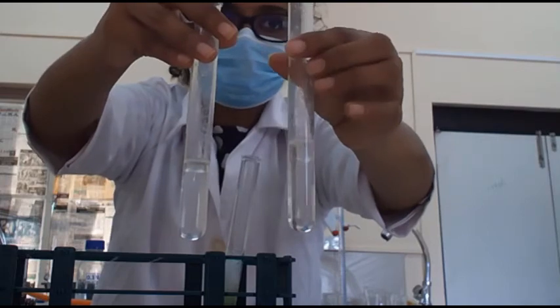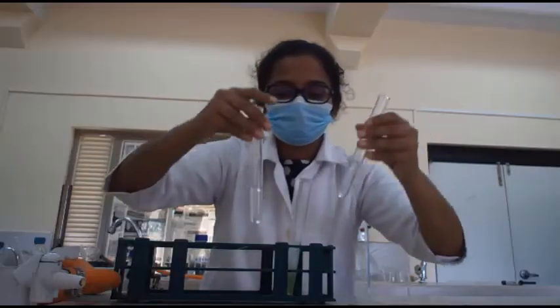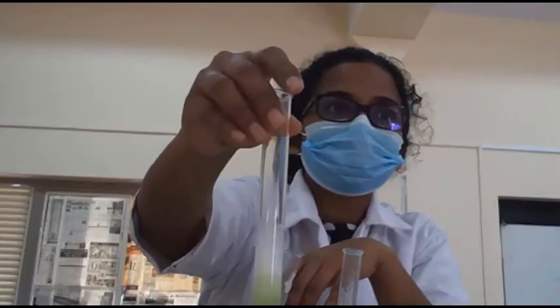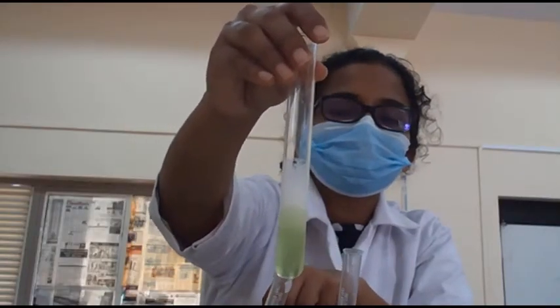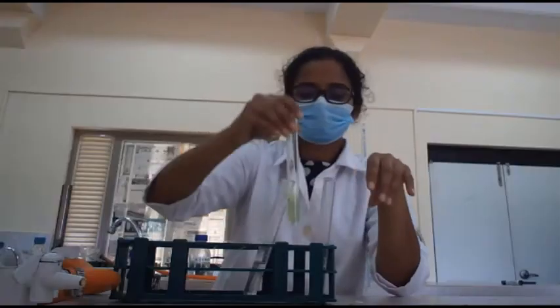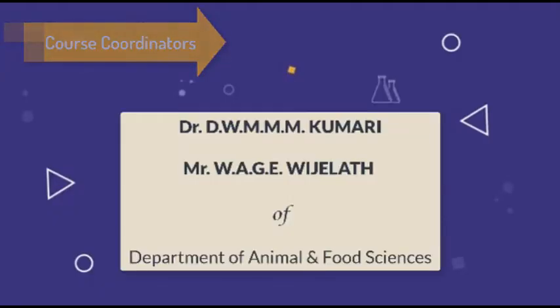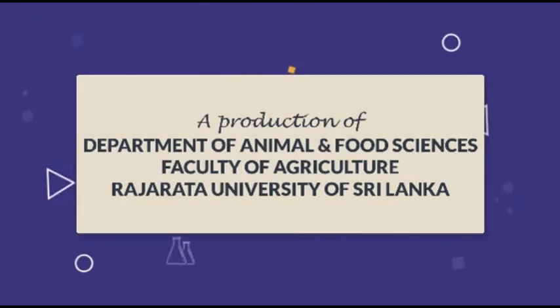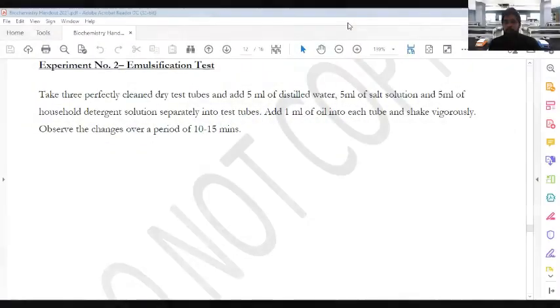That means they are not properly dissolved. But in the detergent, you may see it is well dissolved.